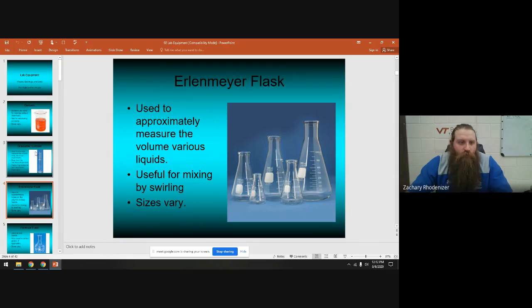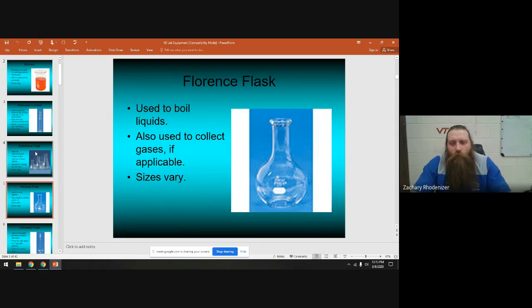Erlenmeyer flasks are good for holding volumes — just like beakers, they're not good for measuring. They give you an approximate number but not an accurate measurement. They are useful for mixing things by swirling: hold the top and spin them in your hand to swirl the contents.